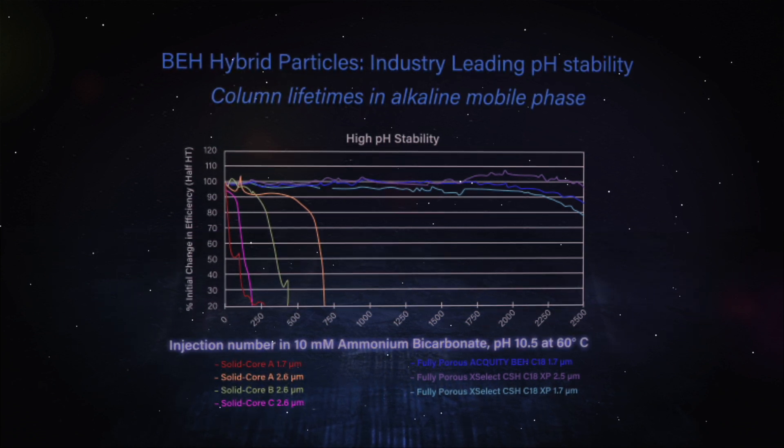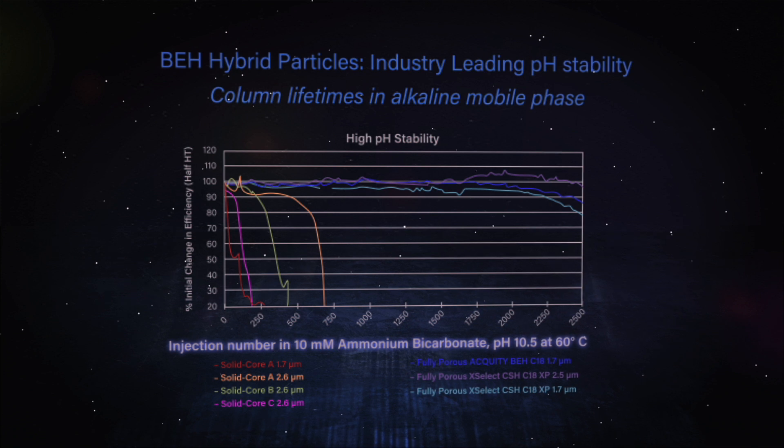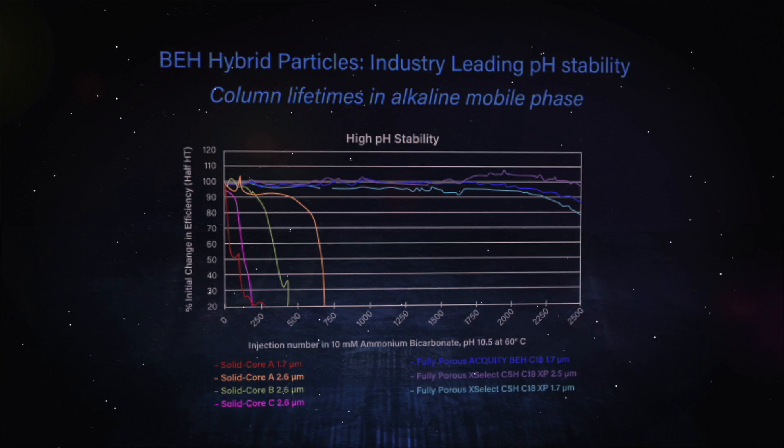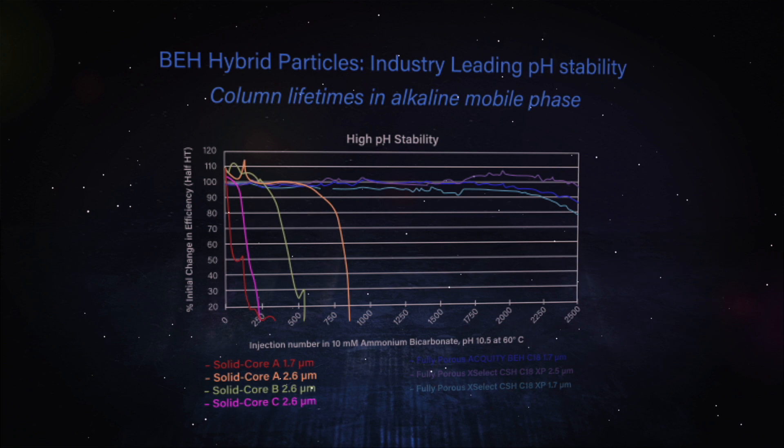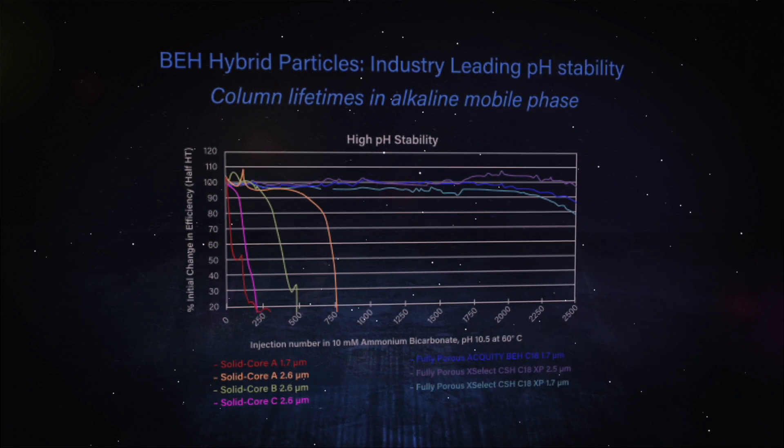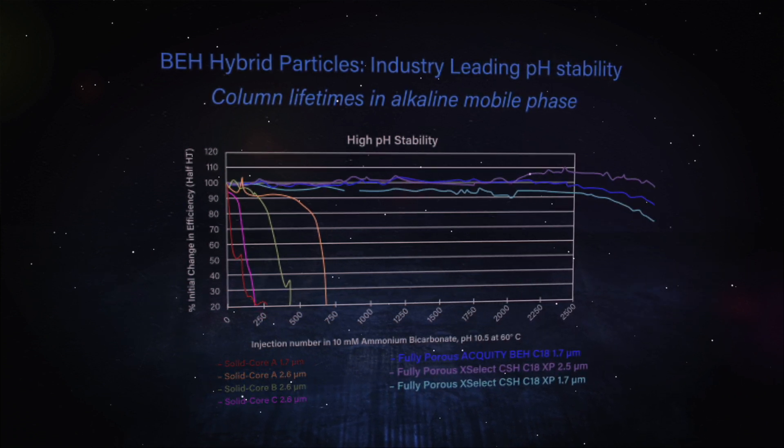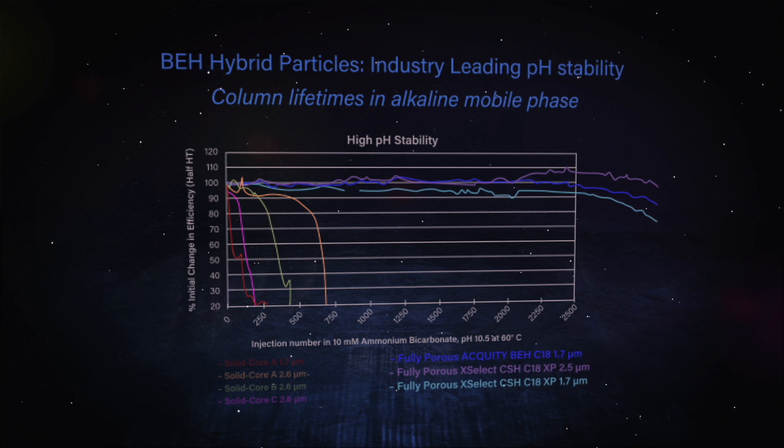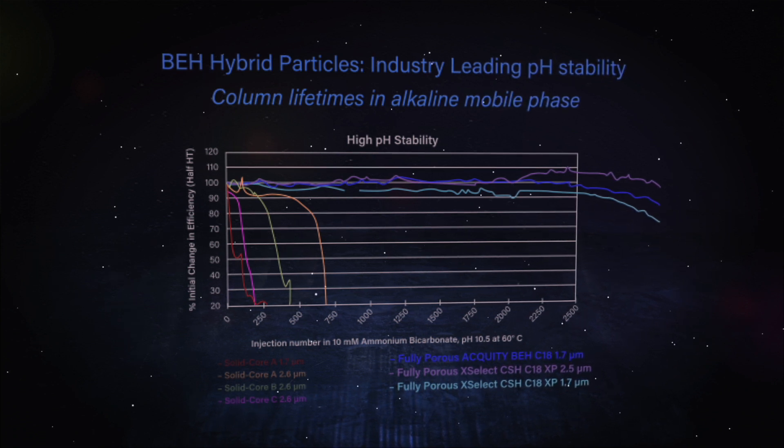So here we've subjected a variety of columns to my favorite column kill test, where we put them in 10 millimolar ammonium bicarbonate at pH 10.5 at 60 degrees C. And you can see from this graph that anything that's silica-based doesn't last very long. But you get really good stability and performance out of columns that are designed for that, such as the hybrid column.